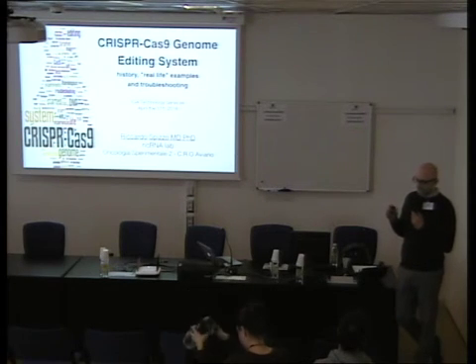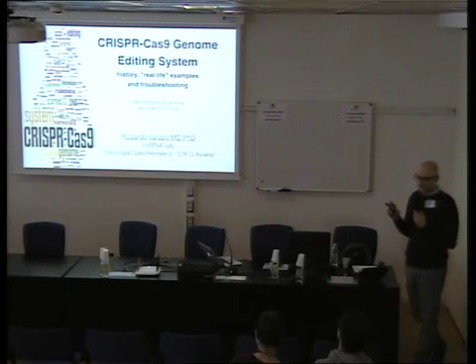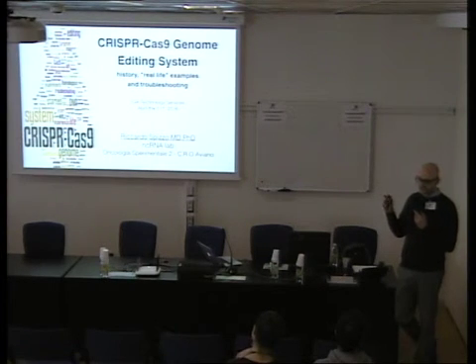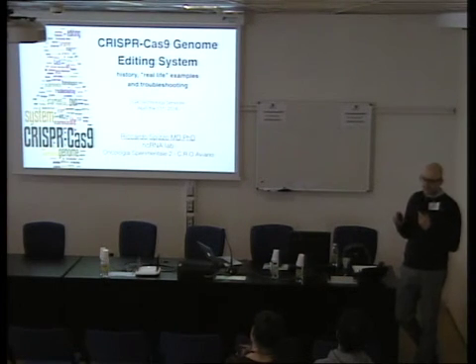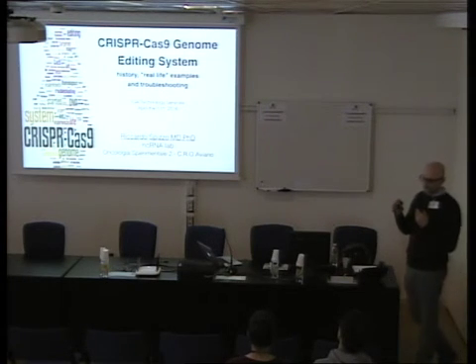About 2 years ago, since we are working with non-coding RNA regions of the human genome, we started using the CRISPR-Cas9 system, since it's very useful for our research projects.